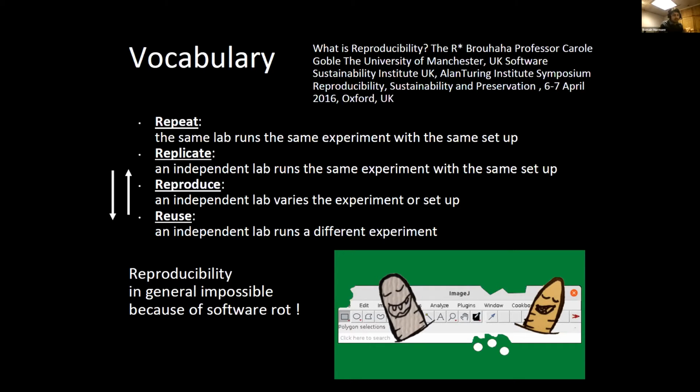So over time, the state of the software evolves and makes it difficult to reproduce a result when you come back a few months later to a workflow, because maybe this plugin has changed something. That is actually difficult by the very nature of how software evolves.